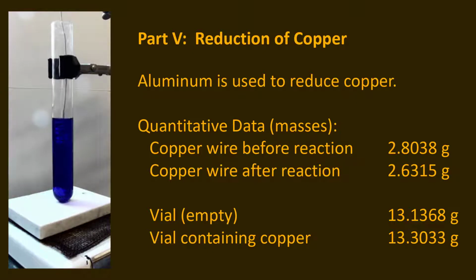Even in the presence of an acidic solution, one of the things that's a problem is that the acid will react with the aluminum oxide surface if it's sufficiently strong, and that'll generate hydrogen gas, and the aluminum ions will move into solution. But the aluminum binds water, and within a very short period of time, only a few molecular distances, usually the aluminum with the water stuck to it will precipitate out again as aluminum hydroxide. And so you actually get kind of a jelly coating on the outer surface of the aluminum that isn't more accessible than the aluminum would have been with the aluminum oxide to begin with.